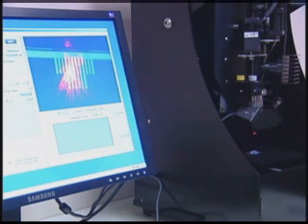In addition, we may actually work with developing sensors where we want to detect a lot of different targets at one time. And this tool allows us to spot specific capture molecules that can bind to either cells that we're interested in, viruses, or even some of the DNA and proteins that are associated with those pathogenic organisms, in order to identify them and find out if they're in a sample or maybe even in a person.